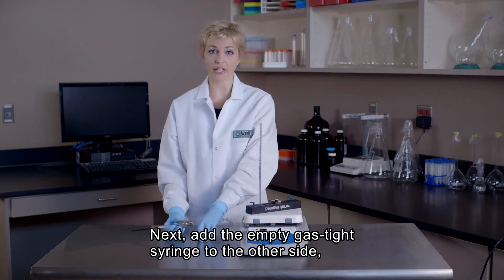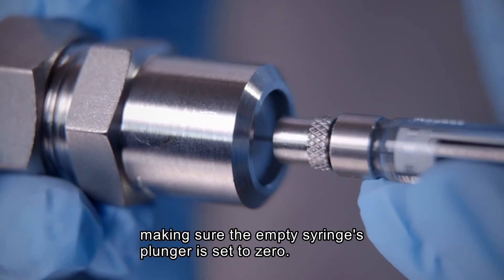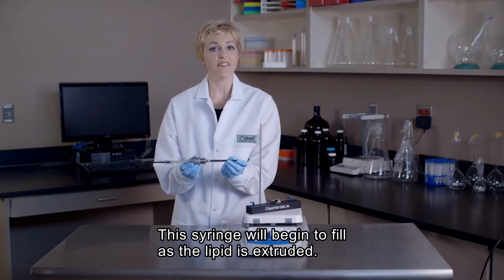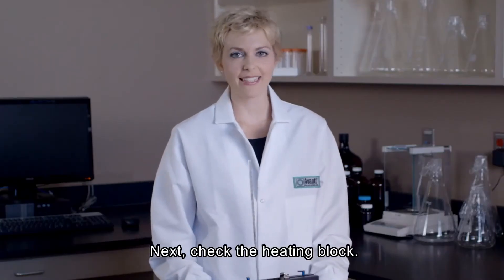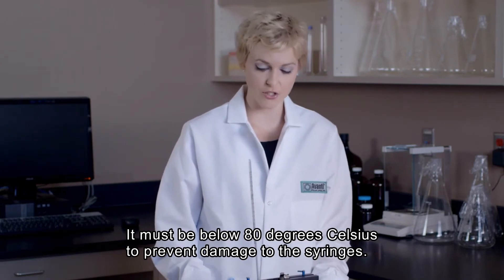Next, we will add our empty gas-tight syringe to the other side of the mini extruder, making sure the plunger of the empty gas-tight syringe is set to zero. This syringe will begin to fill automatically as the lipid is extruded through the membrane. Next, we need to check the temperature of our heating block. The temperature of the heating block must be below 80 degrees Celsius in order to prevent damage to the syringes.